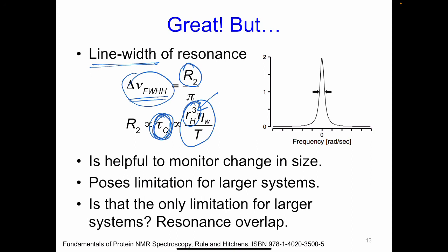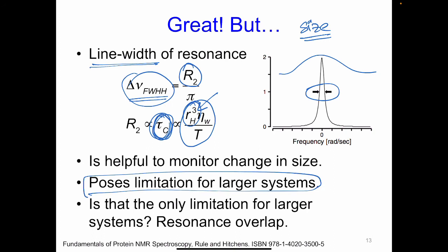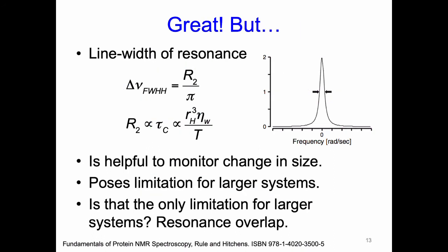Immediately you can understand molecular size poses a severe limitation on NMR spectroscopy: if the lines become too broad, you might not see the resonance. This is indeed a limitation for solution-state NMR spectroscopy, where predominantly people look for proteins of sizes of 25 kilodalton as a ballpark range, and with additional specific labeling, people can go up to 50 kilodalton.